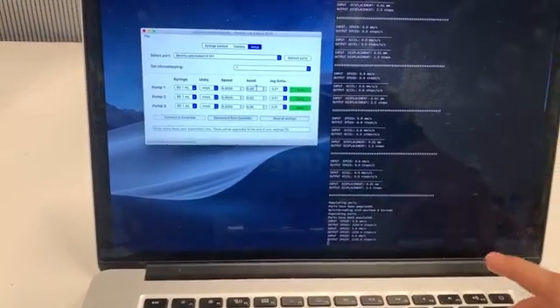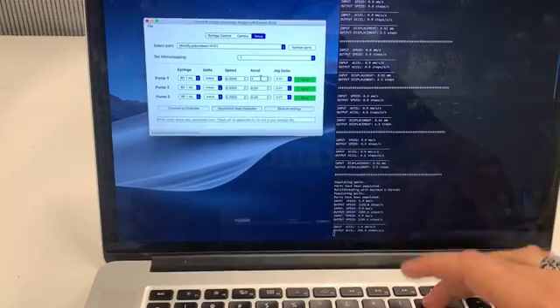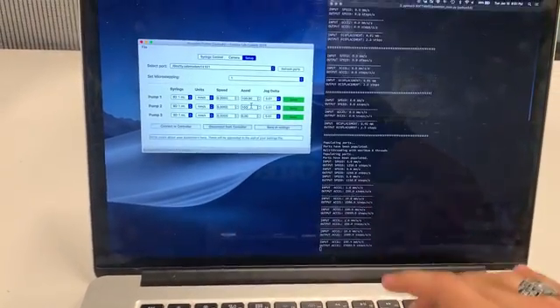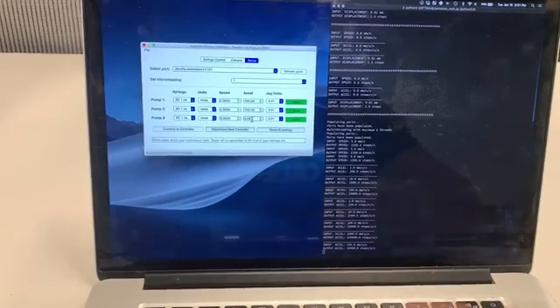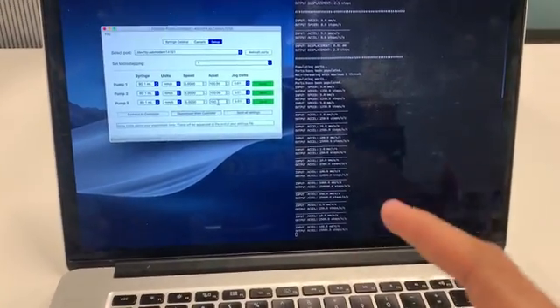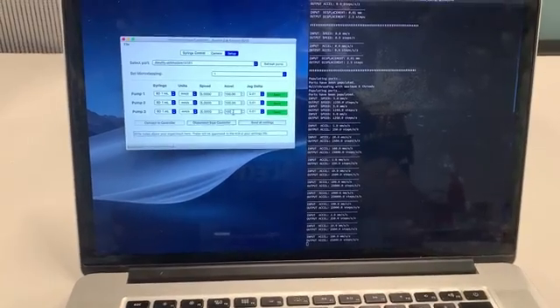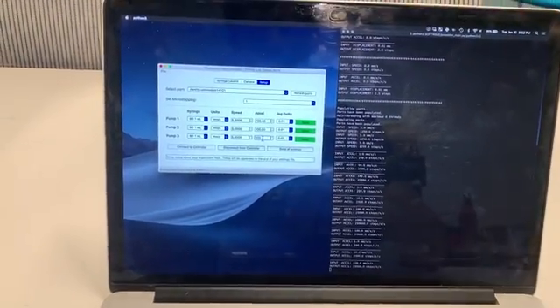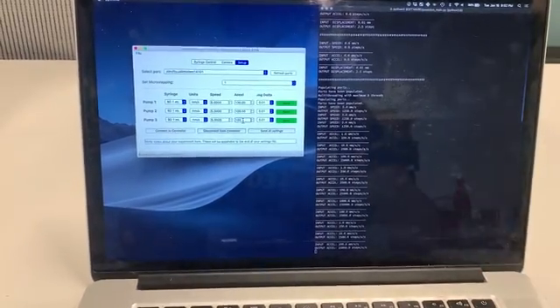We'll set an acceleration value high enough so that the speed profile will be relatively constant, though you could change this as you see fit. Note that as I'm changing these things, the terminal on the right-hand side updates — this is really useful if you want to debug something, like if you didn't have the right flow rates or set the microstepping wrong.